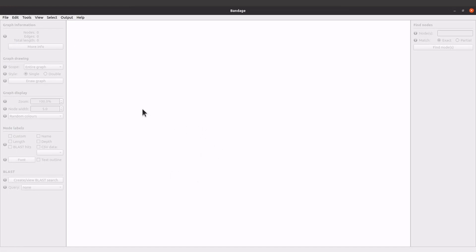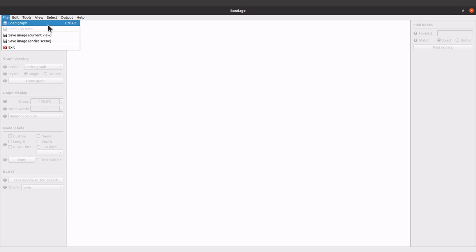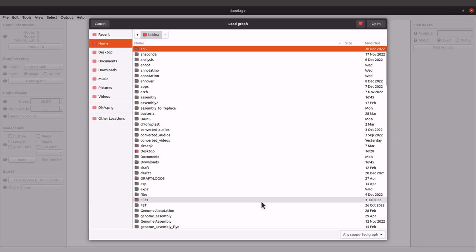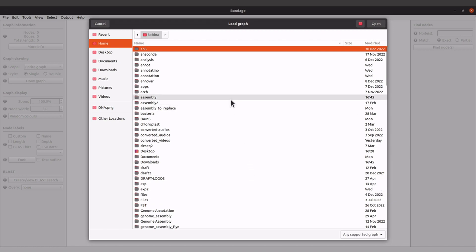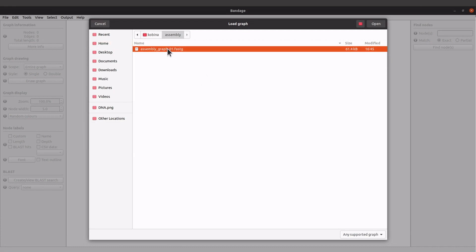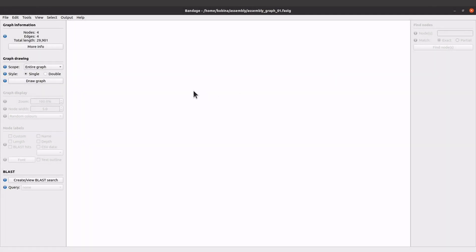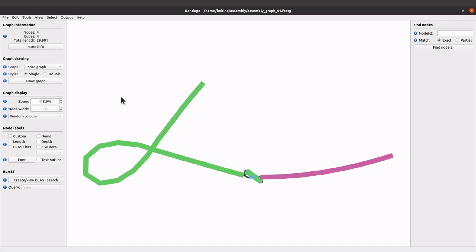We are back in Bandage. When you want to load an assembly graph you have to come to File and then click on Load Graph. You can then search for the directory which has the file. I'll select the file here — after clicking I'll see information here: nodes, edges, total length. Once we have this information, things are looking good. You can click on More Info but we'll leave it. If everything is okay, come to the Draw Graph button on this side and click it.